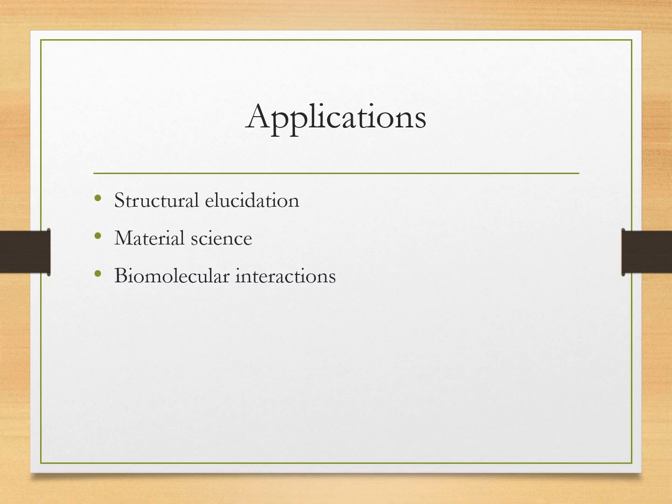Hydrogen bonding analysis by IR has wide applications in structural elucidation of organic compounds, polymer chemistry, material sciences, pharmaceutical research, biomolecular interactions such as protein folding, and supramolecular chemistry. By understanding H bond effects, we gain insights into stability, reactivity and molecular architecture.